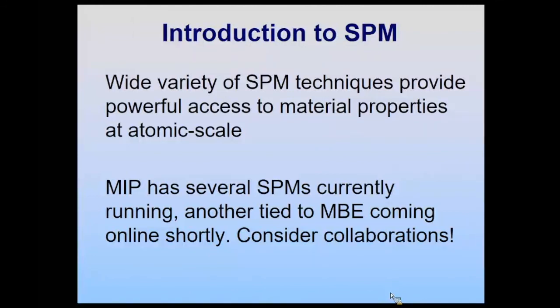So just to follow up on that, the MBE system that has this in situ characterization on it, we're currently assembling it now. We expect that it will be available for the community to write proposals to use sometime in the beginning of 2018. The room was refurbished. It's a state-of-the-art facility, but we are testing it now, putting it together to make sure that it is completely good for when the community wants to write proposals to use the machinery. So check back a little bit later.